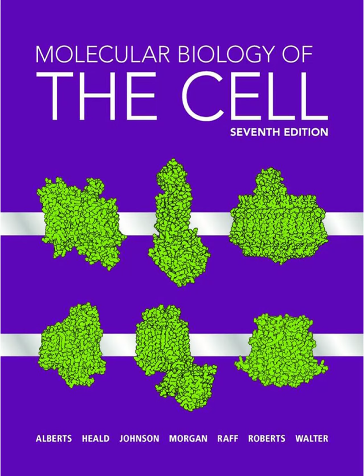Okay, find the center of the blur very accurately. But how do you image just one molecule at a time when they're packed together in the cell? That's the genius. Use photo-switchable fluorescent proteins, or dyes, molecules that you can turn on and off with different colors of light. You start with almost all your labeled molecules in a dark or off state. Then you use a very weak pulse of activation light to randomly switch on only a sparse subset of molecules, so they're far apart from each other. So only a few dots light up randomly.